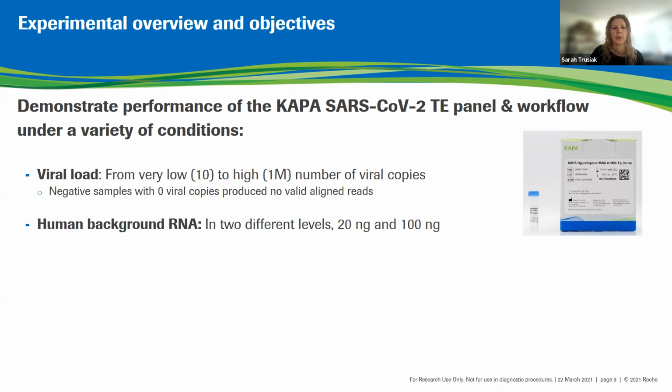We also had our human RNA background, and we tested our viral titration in 2 different levels of this background, both 20 nanograms and a higher background of 100 nanograms.